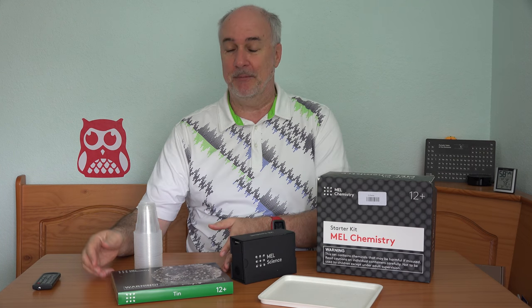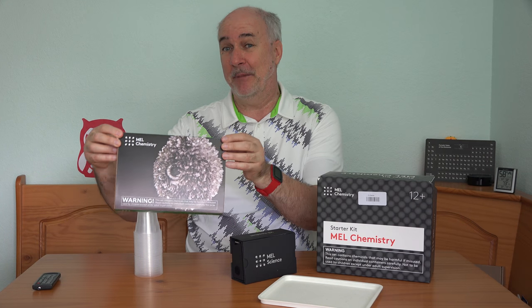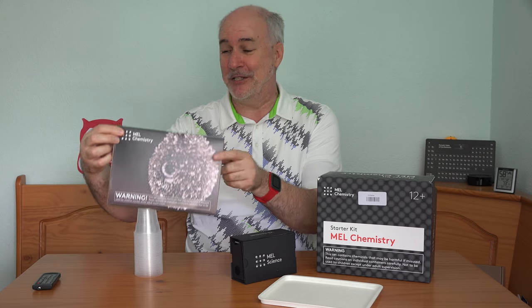Hi, I'm Parris and I'm back again posing as a scientist. A few weeks ago I did a video on an experimental kit sent to me by Mel Chemistry — I think that one was called The Science of Monsters — and in that video I asked if our viewers were interested in seeing me try out this other kit on tin and making really cool things. And a lot of people were interested, so I'm back to do another video that will test what I remember from high school chemistry class.